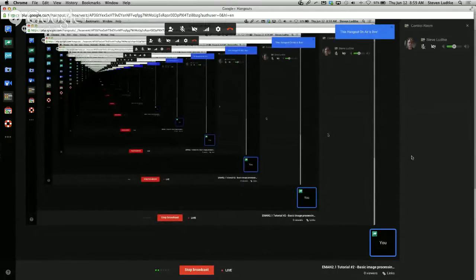Okay, we're live again this morning. You'll probably see the infinite recursion of windows on the display right now as I'm sharing my desktop. Still haven't found a really good way of handling that particular issue.